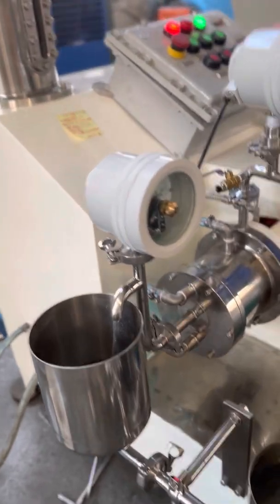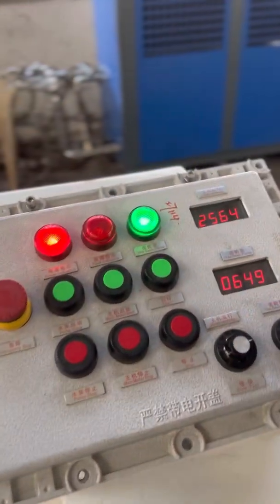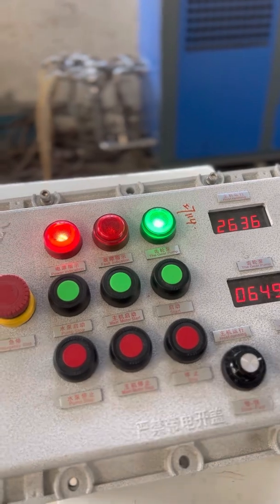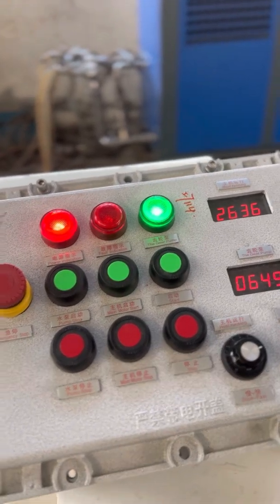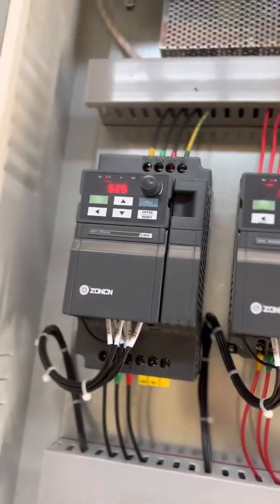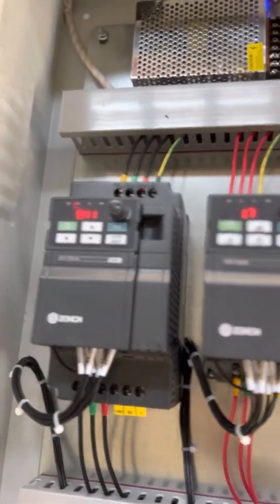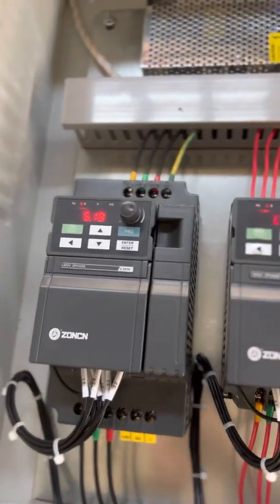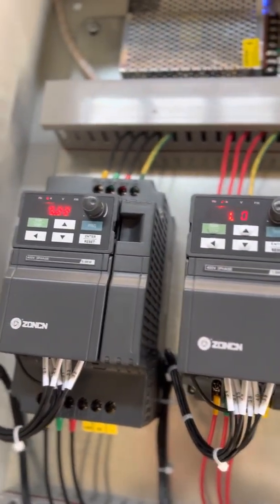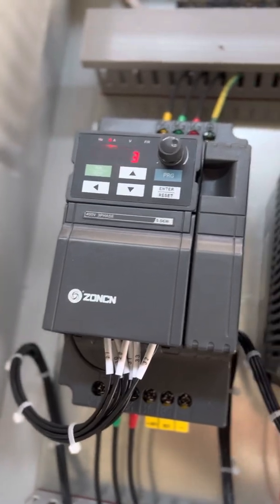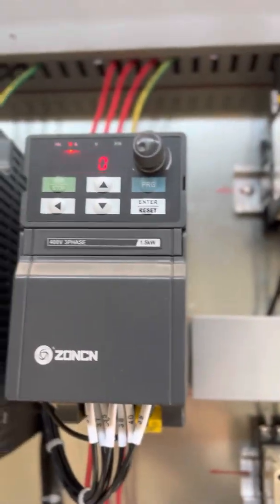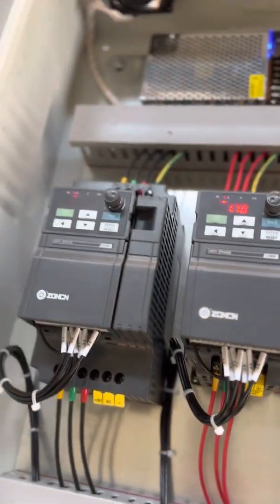And this one is the pump speed. We can adjust it to 3000 rpm here. And this is the frequency inverter. You can see the current on the panel.